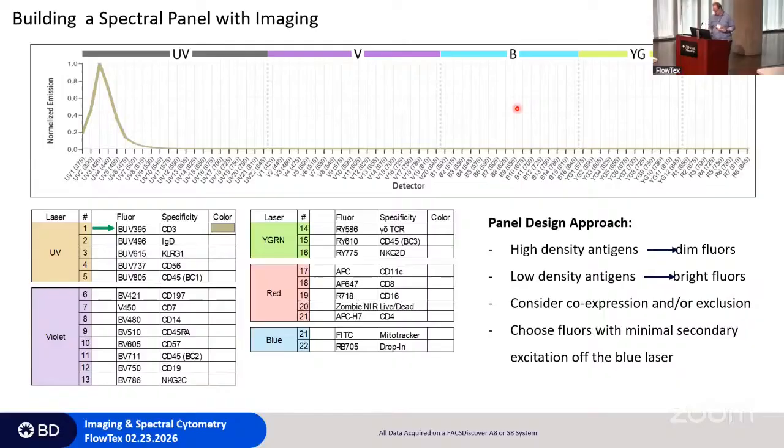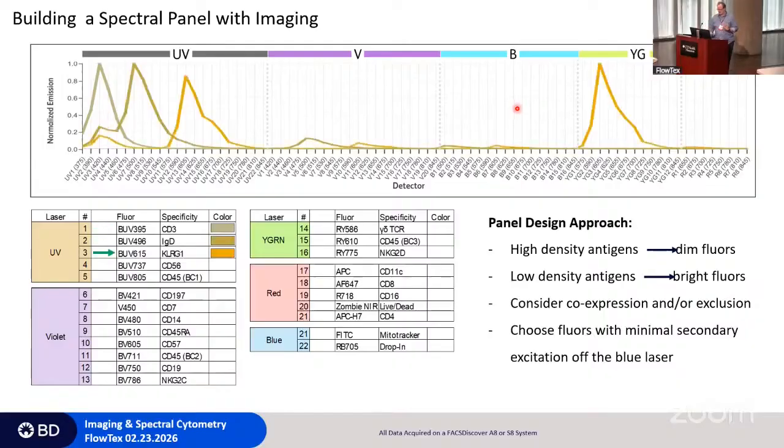that's going to confound my imaging. The way I do that is I go through this, and you can start to see these bumps down here. The values on these are normalized, so it's taking the brightest peak and making it 1. So it doesn't represent how big that bump is in the blue. It's a little misleading because of how small these are, but I'll show you how to get around that.